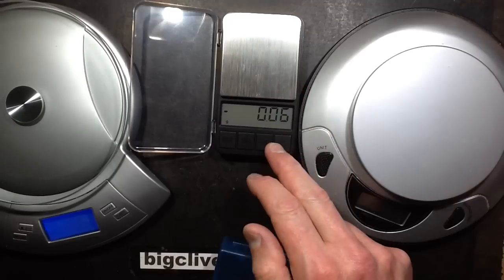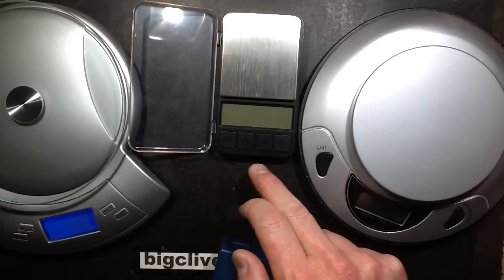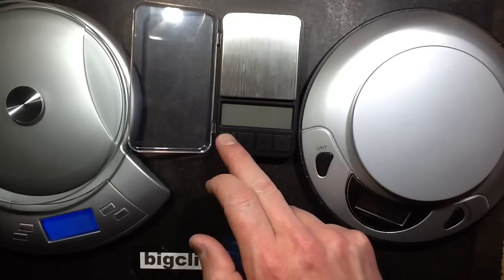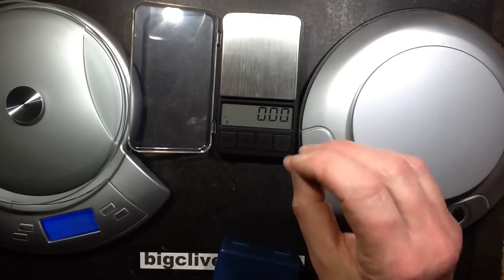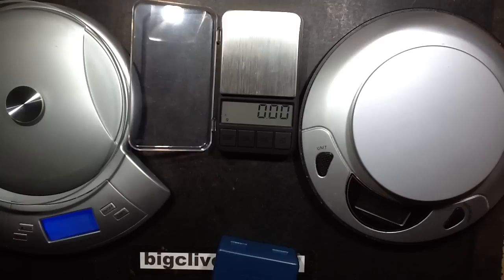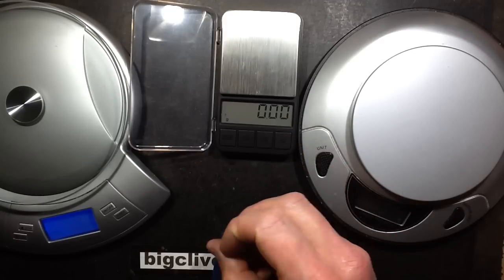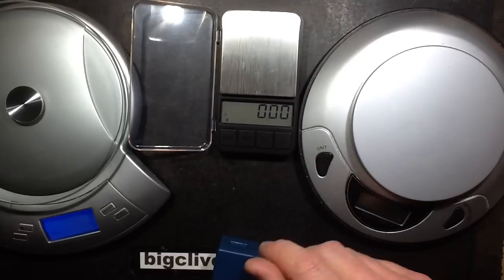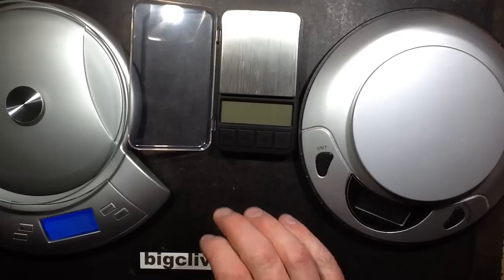The wee digital scales — the super accurate ones — these go down to one hundredth of a gram. They're super accurate and ideal for weighing small quantities of chemicals, liquids, and things like that, giving very accurate values even from very light stuff. You can also use them for counting components, which is handy — you give it a sample of a known number of pieces and then literally you can just put a sprinkle of components on it and it'll tell you how many are in the tray. All very accurate.